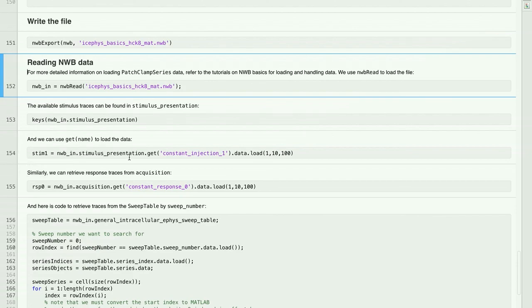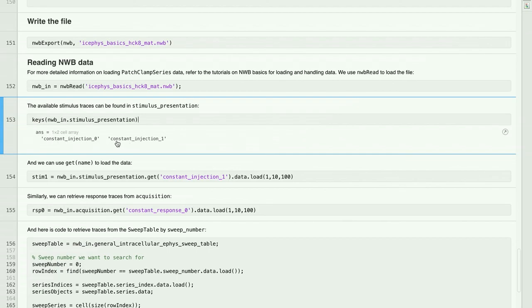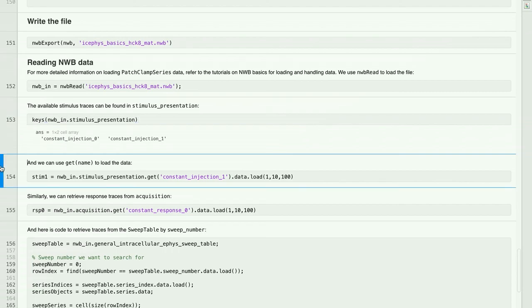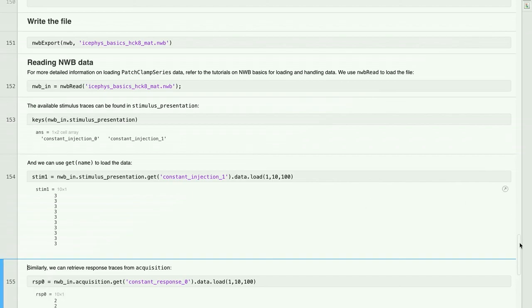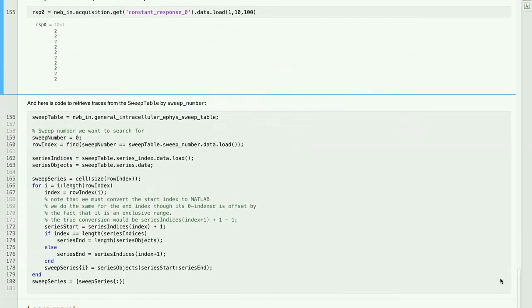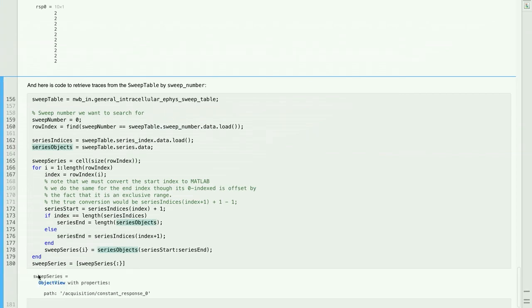The available stimulus traces can be found in stimulus.presentation, which returns the names of the stimuli we added to the file. I can now use a GET method with that name to load the data. Note that we use SET methods to add data to our file and GET methods to retrieve it. Similarly, we can retrieve response traces from acquisition using the GET method. Finally, I've included a code snippet that allows us to retrieve traces from the sweep table by accessing using a sweep number. Giving it a sweep number of zero returns the path to the response trace with sweep number zero that was added to the sweep table.